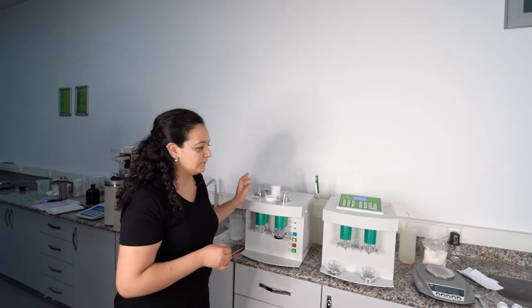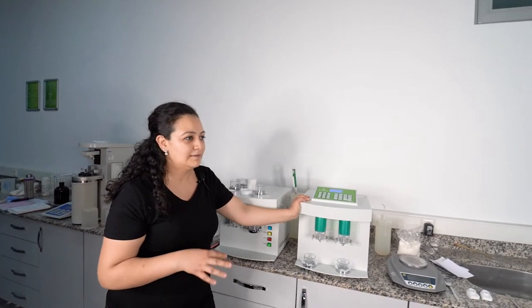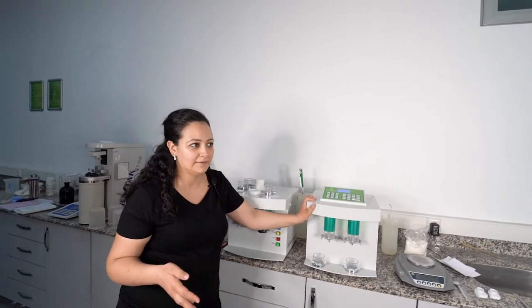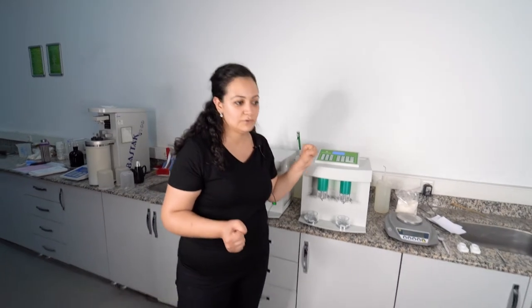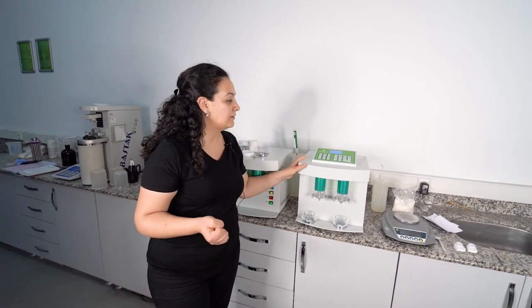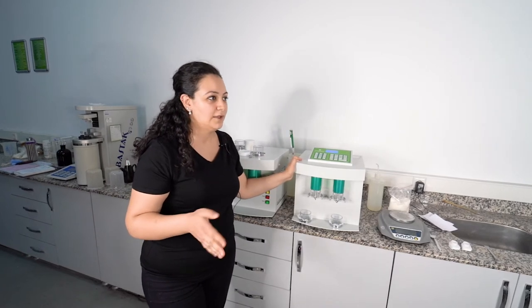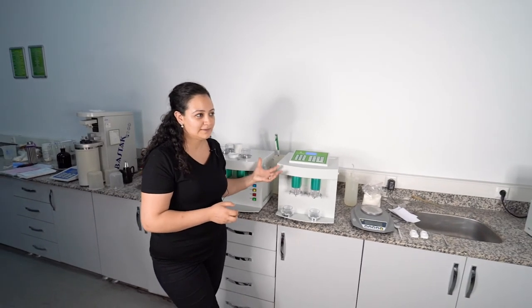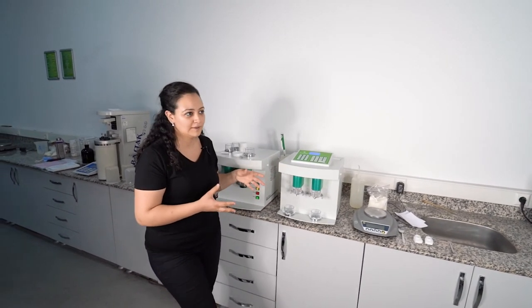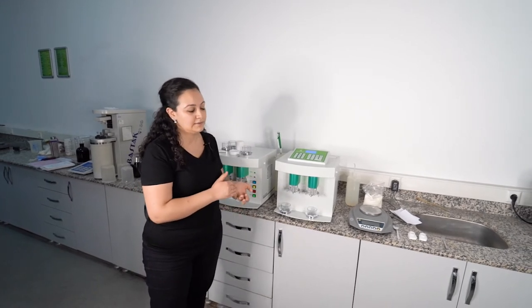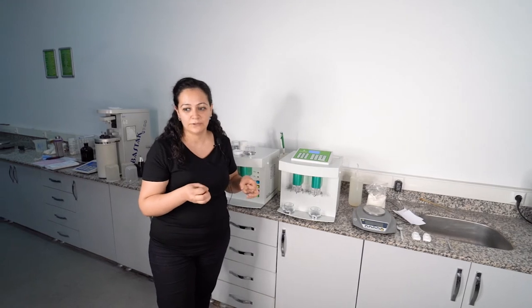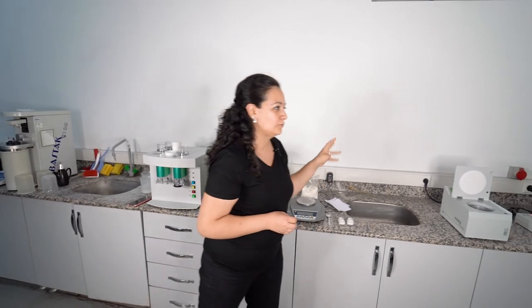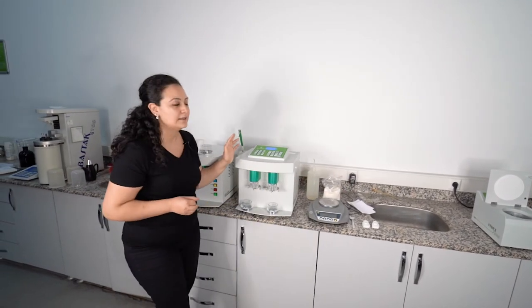For the blue bread, gluten value should be around 80 to 90 for baklava, for pasta, for bread. But if you are using the biscuit, you should get the result around 20 to 25. You can get lots of gluten, but it doesn't mean that you have good gluten quality. Amount is a parameter, but the important parameter is the strength of the gluten. If you have a good gluten index result, that means you have good gluten quality. The amount is not important every time.